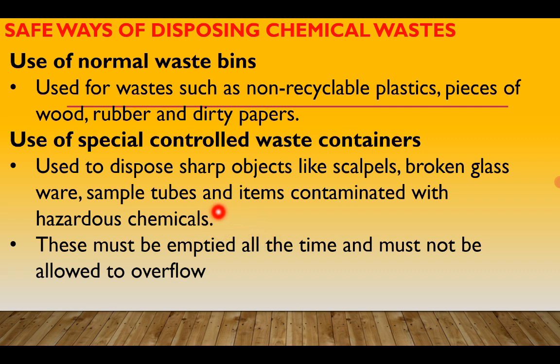All right. So we are saying that in order to dispose of waste, we use normal waste bins, which are designated for disposing of non-recyclable plastics, pieces of wood, rubber, and dirty papers. We can also use special controlled waste containers, which are used to dispose of sharp objects like scalpels, broken glassware, sample tubes, and items contaminated with hazardous chemicals.